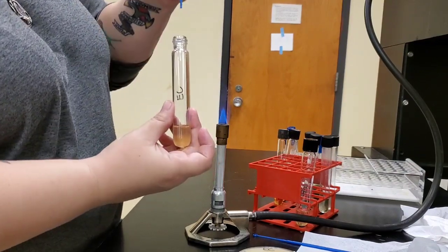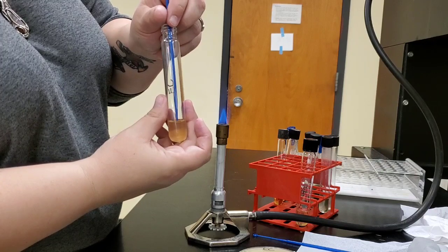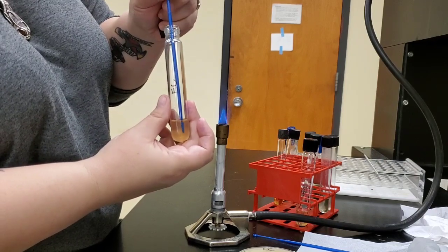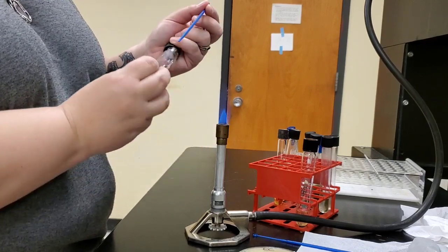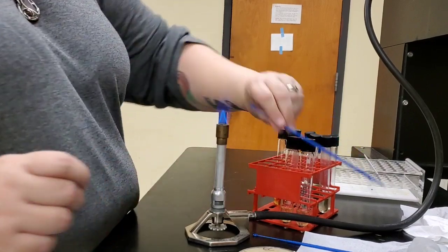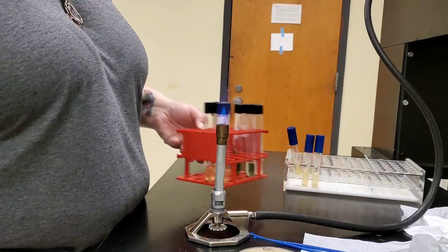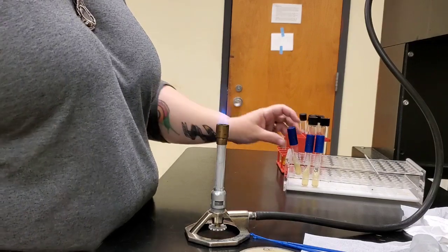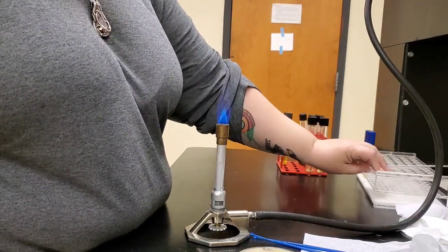And again, stab straight down into the medium, about 2/3 of the way down, and then you lightly cap the tubes because they are going to need an aerobic environment in order to grow and produce that exoenzyme.